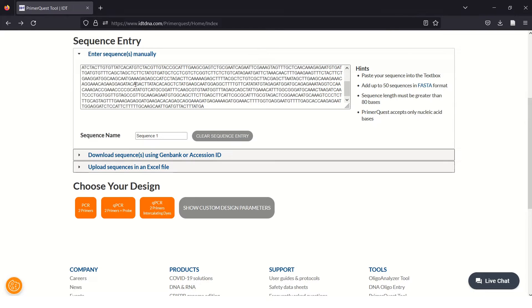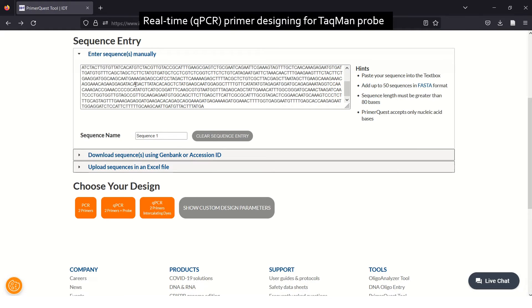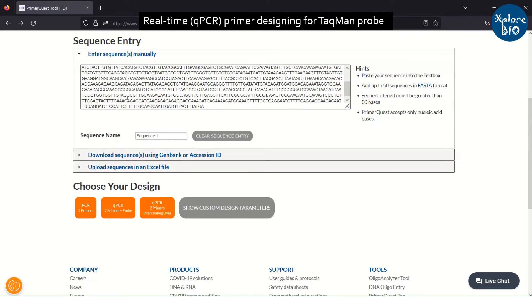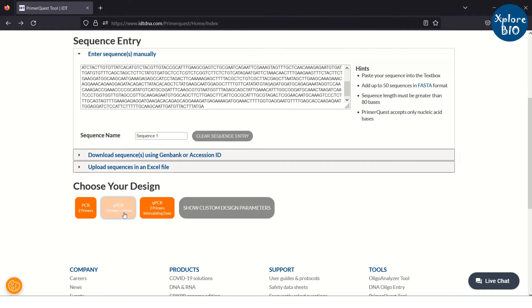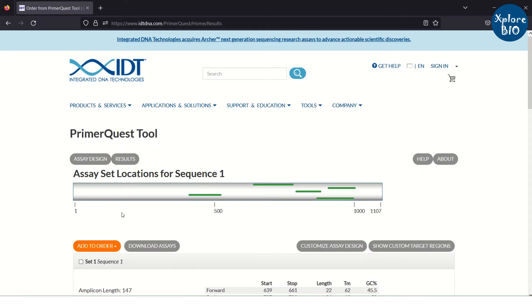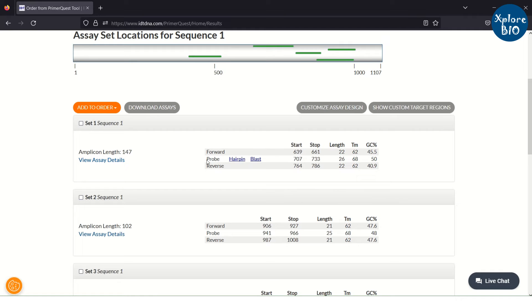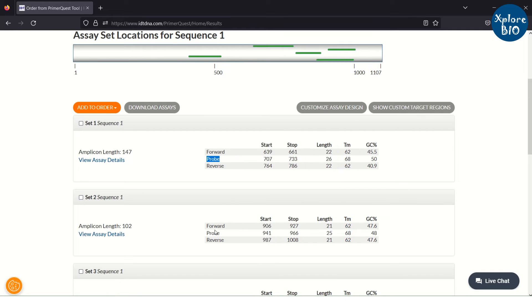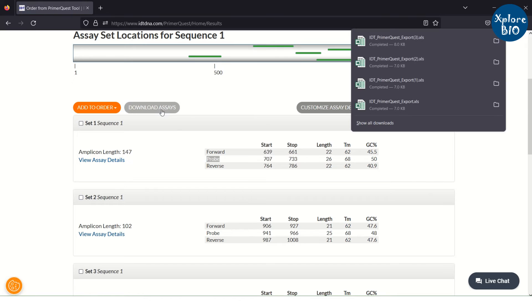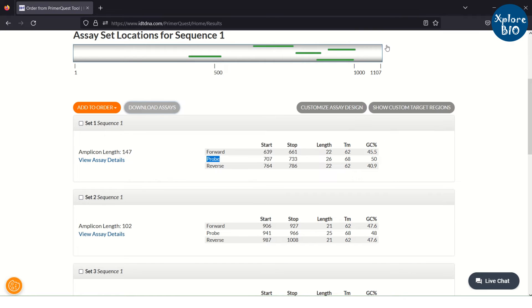If you want to do TaqMan probe-based real-time PCR analysis, you can choose the other option. Here you can see a probe sequence along with the primer sequences. You can download and choose any of the selected primer and probe sets for your experiment.